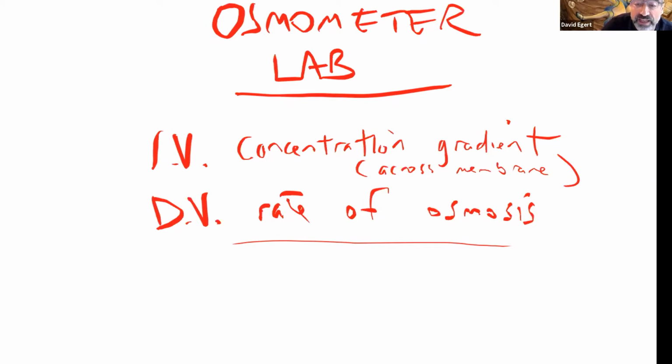But we're going to see that can be tricky sometimes. The thing you're really interested in is not what you're directly measuring. So you have to make sure you understand how tightly coupled your actual variable of interest and what you're actually measuring are. And we'll see in this lab, to some degree they're coupled, but to some degree they're not totally.